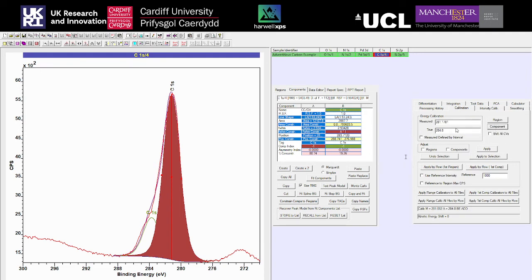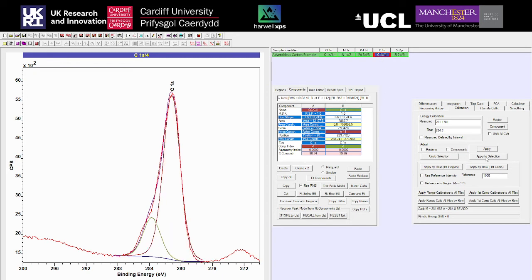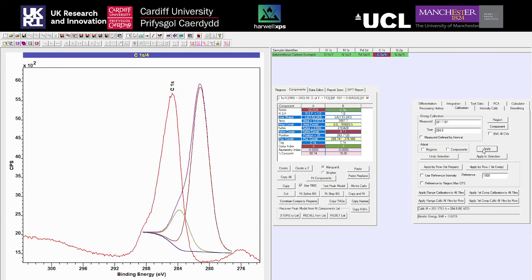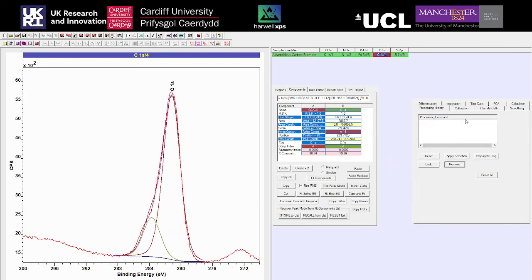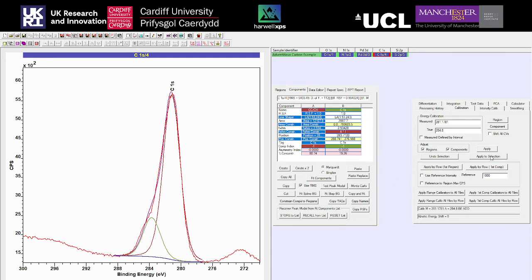Come to Calibration and click Component - that fills the measured energy calibration box with the peak maximum from the component you've fit. Select all the blocks by clicking the sample name. This time I'll also check Adjust Regions and Components. If you apply without this, the peak model is shifted and you'd have to refit. With Adjust Regions and Components checked, it moves your regions and any models by the same amount as the calibration, saving you from redoing work already done.